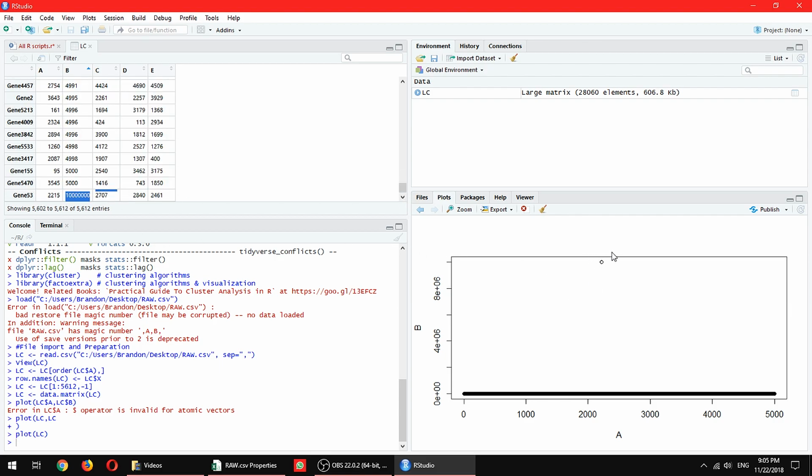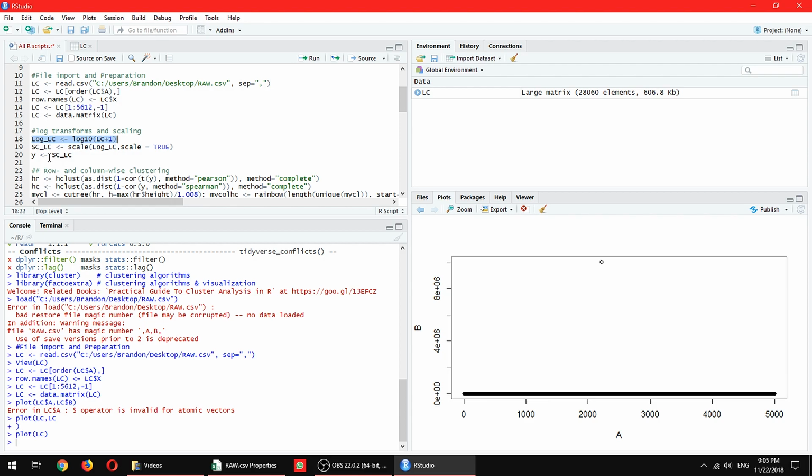In this case, this is so big that it's going to interfere with our data, because when one data point is super big, you can't visualize the rest of them very easily. So what we have to do here is called log transformation. Log transformation is very simple. You just log10 every single value in your matrix. In this case, you have to put a +1 because there are some zero values there. If you have a 0, log10 of 0 will become infinite and it will cause you an error. So what we do is add 1 to every single number within the expression value. Once you add 1, log10 of the value 1 will equal 0.